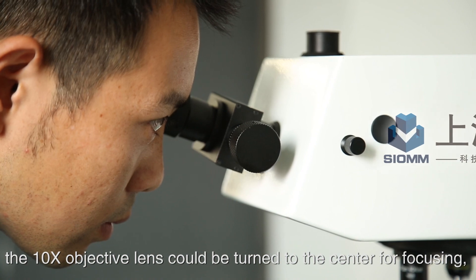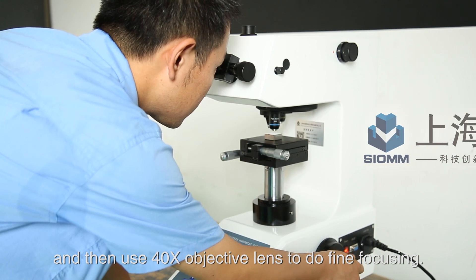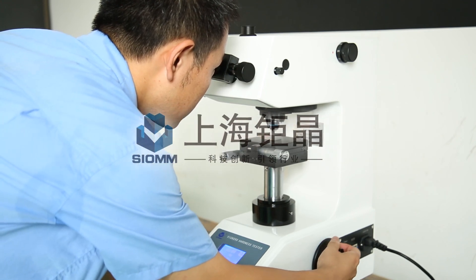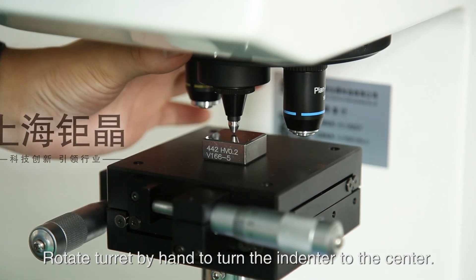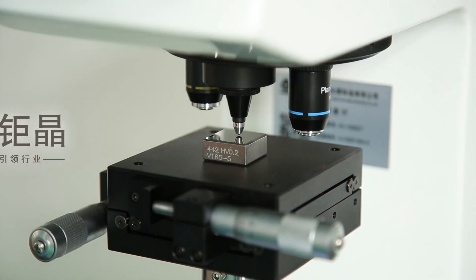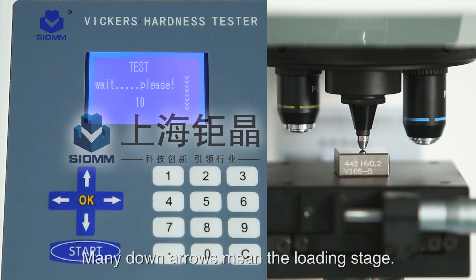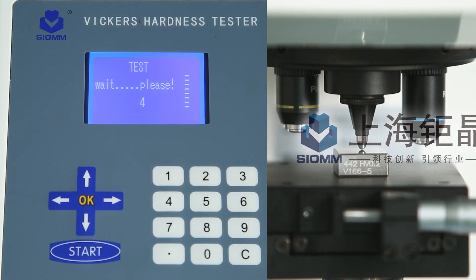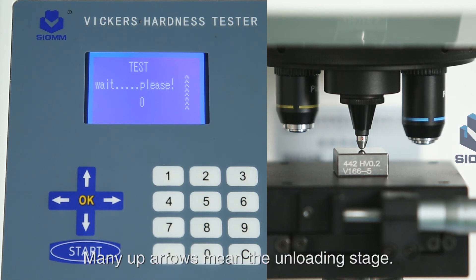If necessary, the 10x objective lens can be turned to the center for initial focusing, and then use the 40x objective lens for fine focusing. Rotate the turret by hand to turn the indenter to the center. Press Start and the machine begins to work — the working stages will show on the screen. Many down arrows indicate the loading stage, many short lines indicate the dwell stage, and many up arrows indicate the unloading stage.